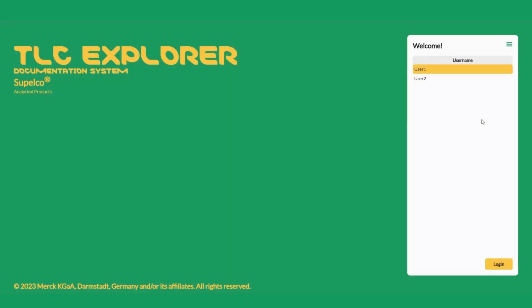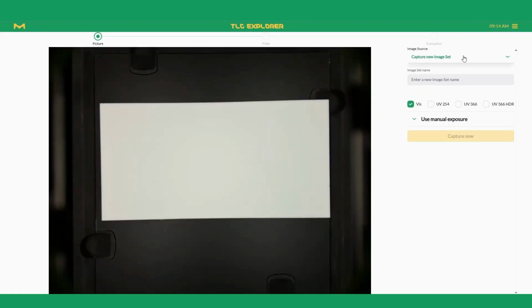To take a picture, select a user and press the Login button. On this screen, you will see a preview picture of the plates which are placed in the Explorer. With the drop-down menu, you can choose between capture a new image set or have a look at previously generated image sets by choosing Load Image Set. To start a new analysis, choose Capture New Image Set, mark your preferred wavelengths, enter a name for your analysis, and press the Capture Now button.